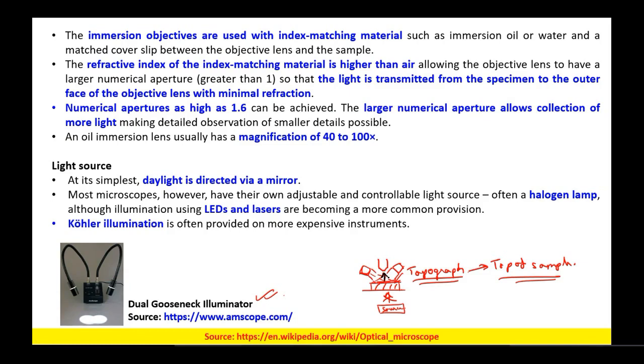Now, when you want to use this kind of illuminator, you need to understand that your microscope is attached with a high working distance objective lens. Otherwise, you will not be able to illuminate the top surface properly. Okay.